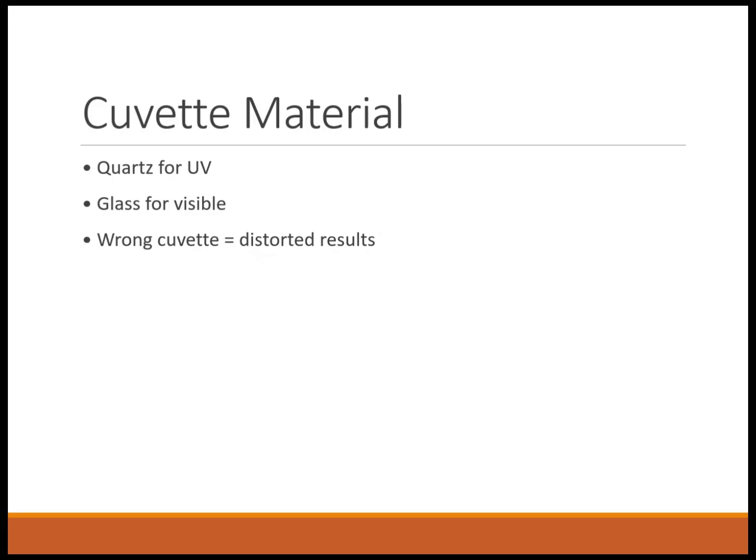Using the wrong cuvette leads to major inaccuracies, especially below 300 nanometers. Below 300 nanometers is the ultraviolet range, and in this case quartz cuvettes must be used.